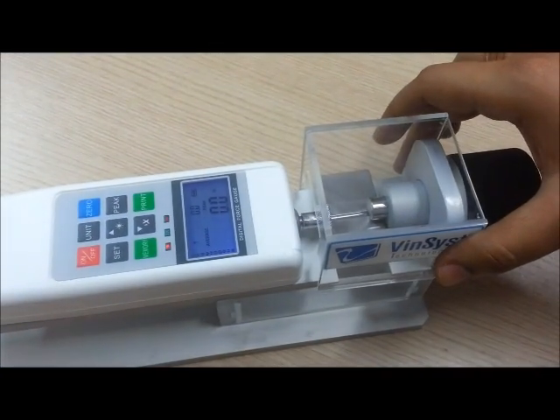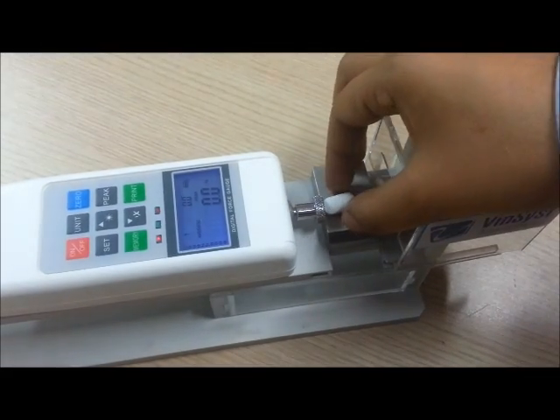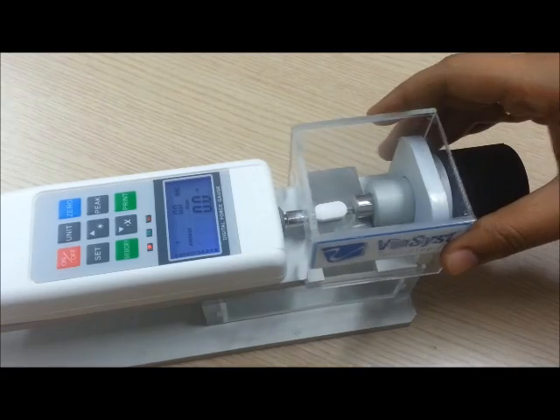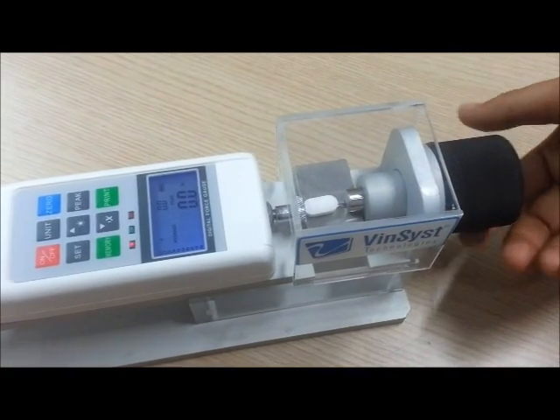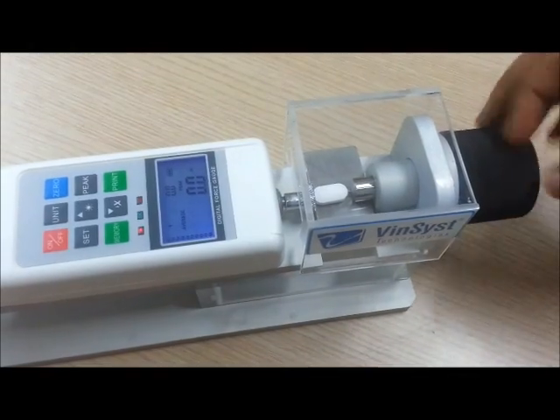We open the safety shield cover. Place a tablet, whichever size or shape it may be, on the device. Close the cover and move the rotary device manually towards the tablet until the tablet has been fractured.